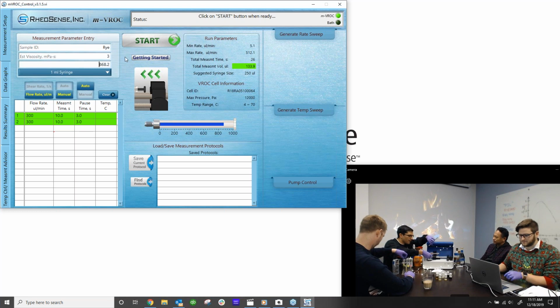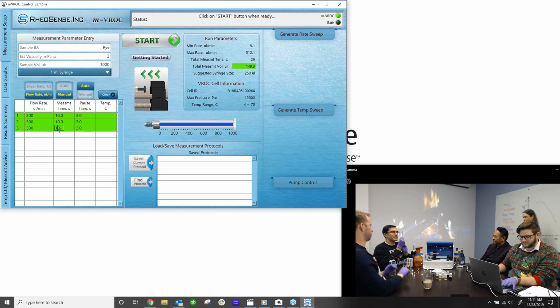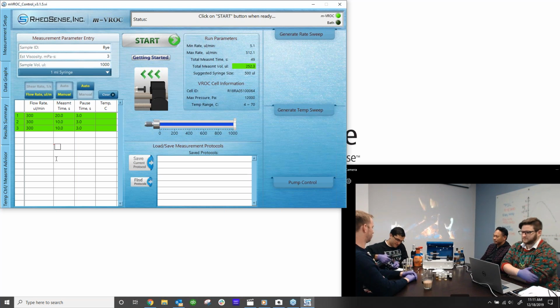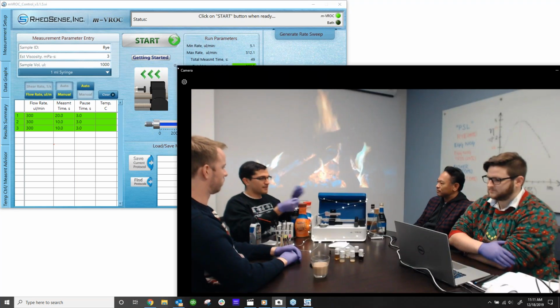And then, so my sample is everyone's favorite holiday beverage, whiskey. And there's a little bubble at the top, so I'm going to remove the bubble carefully and use a lint-free wipe so I can then brush off any residual whiskey and some dust or potential dust so that there is no dust or bubbles that enter our chip.